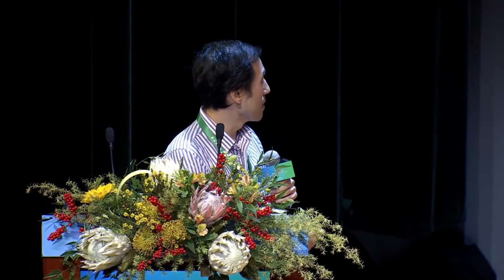Today, I want to tell you about the work we've done in the last decade or so in developing spatial technologies that allow us to look at genomic information directly in situ, in the tissue. And I want to talk about some of the work from this technology that we learned that allow us to extract new biological insights beyond just looking at tissue organization.